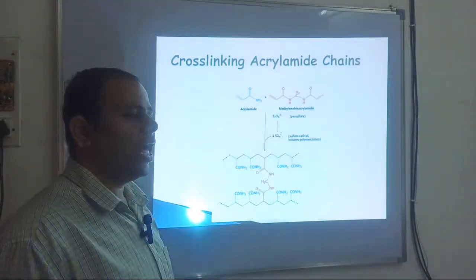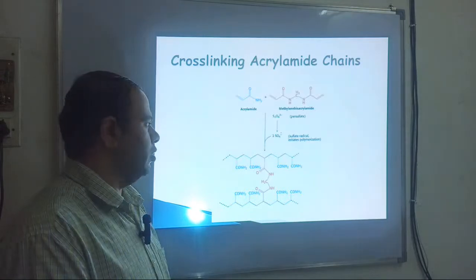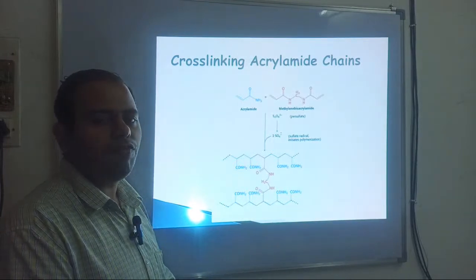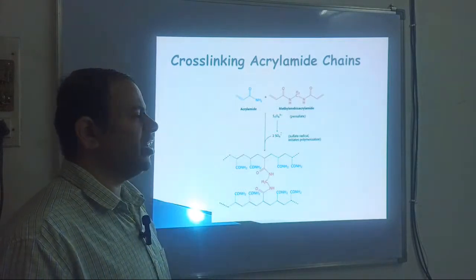persulfate molecule. The requirement of persulfate molecule is there. So while preparing a polyacrylamide gel, you are using a chemical such as ammonium persulfate. Now this ammonium persulfate helps in polymerization. But this polymerization is a very slow process.